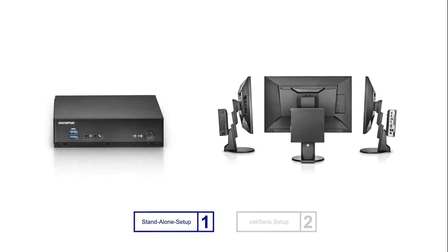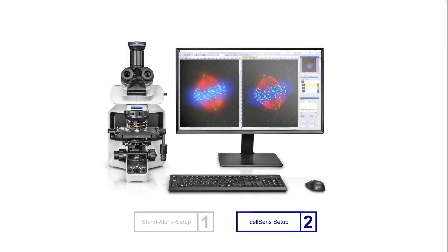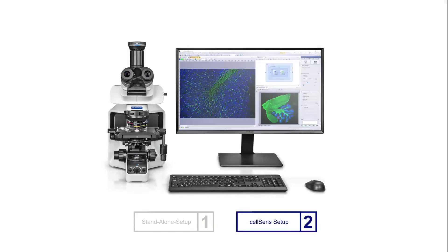Drive the camera using the standalone controller to maximize your use of space, or take advantage of its integration with Olympus Celsons software for even greater functionality.